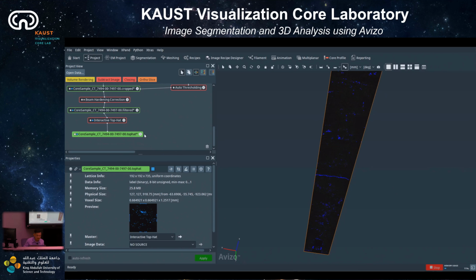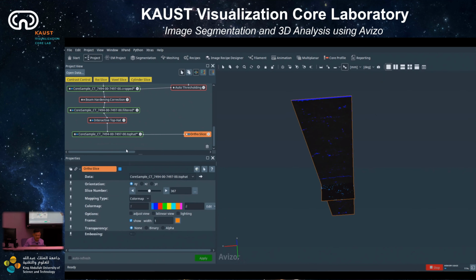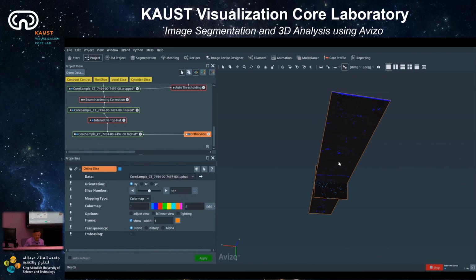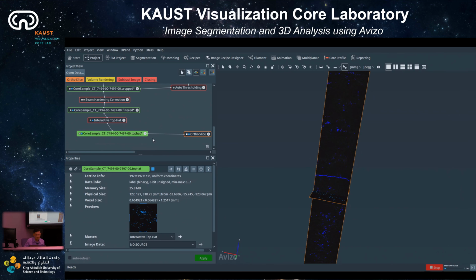And you can see already from the 2D that it looks like this. They have something coming up on the edge. Anyway, this is just pure porosity.